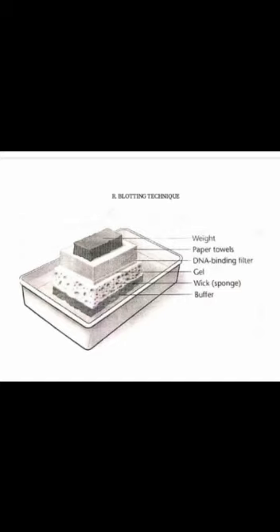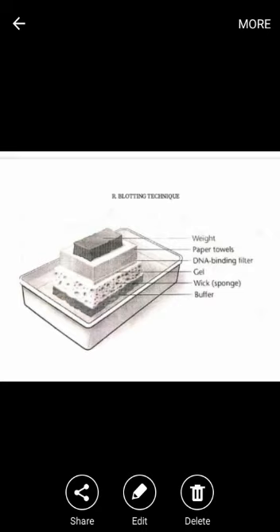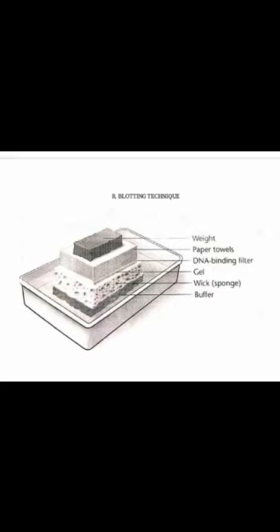First one, southern blotting. This is a DNA blot transfer. It combines the use of restriction enzymes, electrophoresis, and DNA probes.